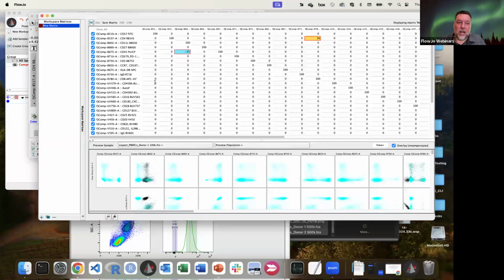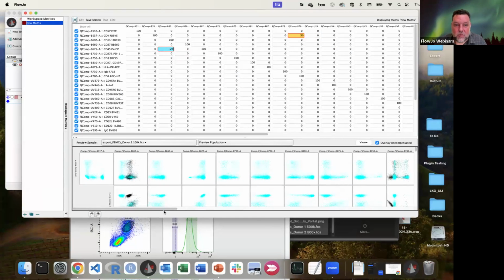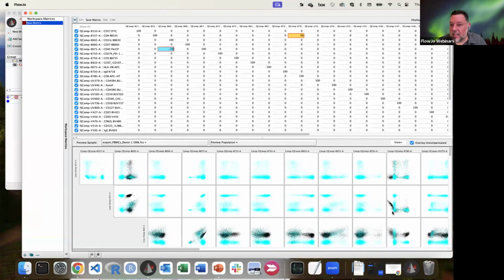So I love that. Forget about the graph window, right? So what did I just do? I made a tweak and I made things skew in a way that was not appropriate, just to show that it works. I would rather stay with the same sample, right? And this negative 25 is going to affect this guy. So let's just put a 0 here.